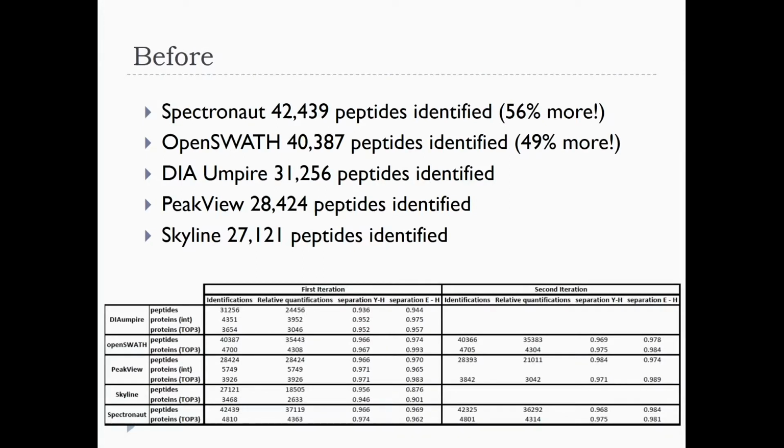Okay, so next experiment, this is the data that you're using from this multi-center comparison. This was the first: Pedro Navarro sent around an email and said, okay, I've done it, I've compared all the tools, he'd been in contact with all of us, and these are my results. Here's Skyline, and this is OpenSWATH and Spectronaut. So what's your hypothesis at this point?